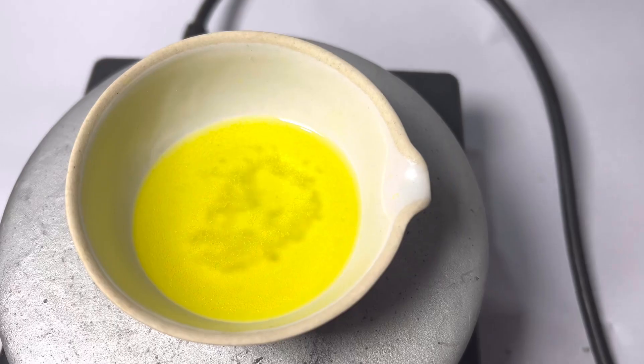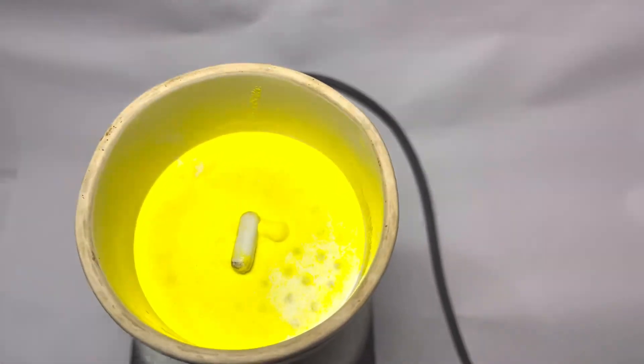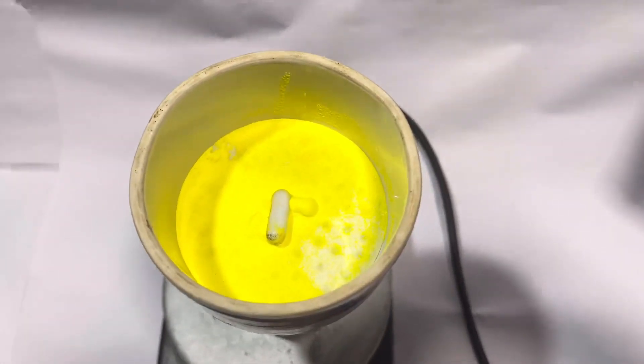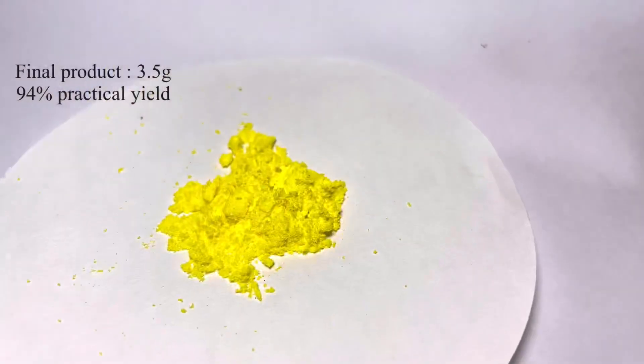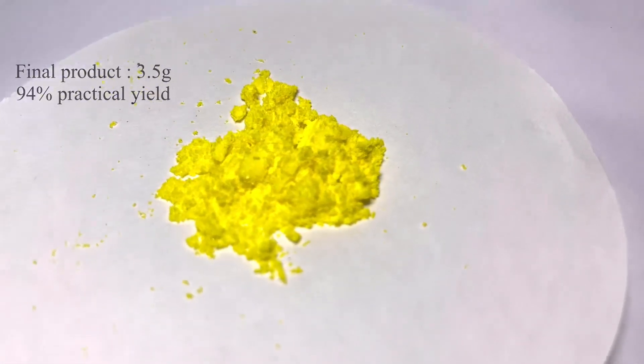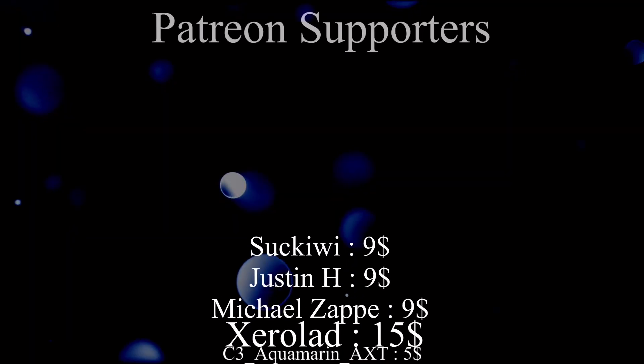Later the microcrystalline yellow precipitate was vacuum filtered and dried. I got around 3.5 grams of the compound, which is around 94% yield. That's all in this video, hope you have enjoyed it.